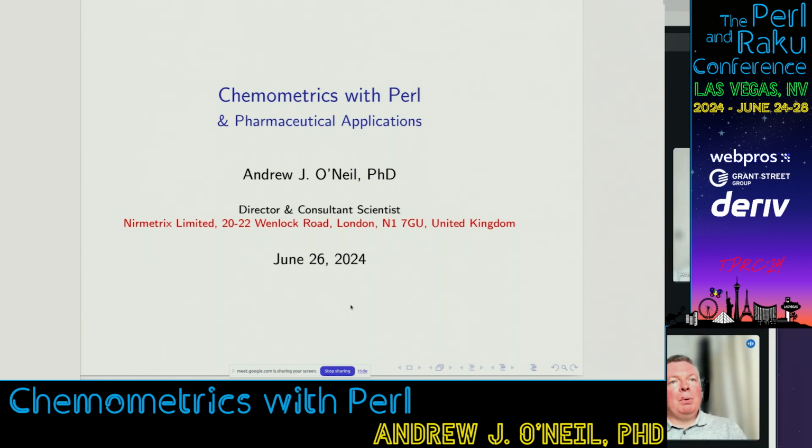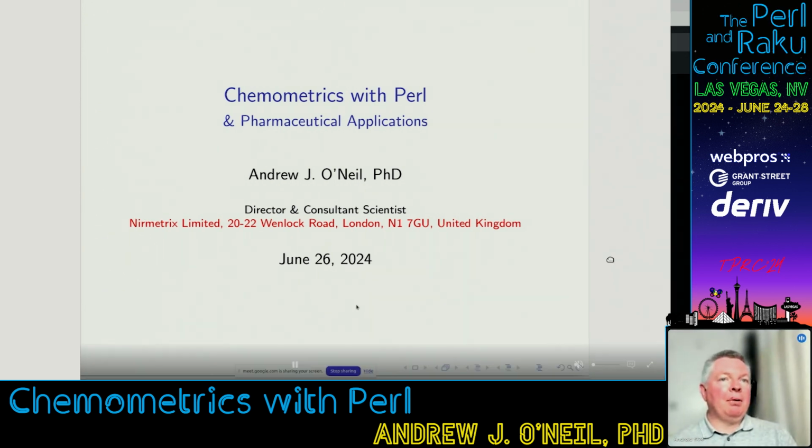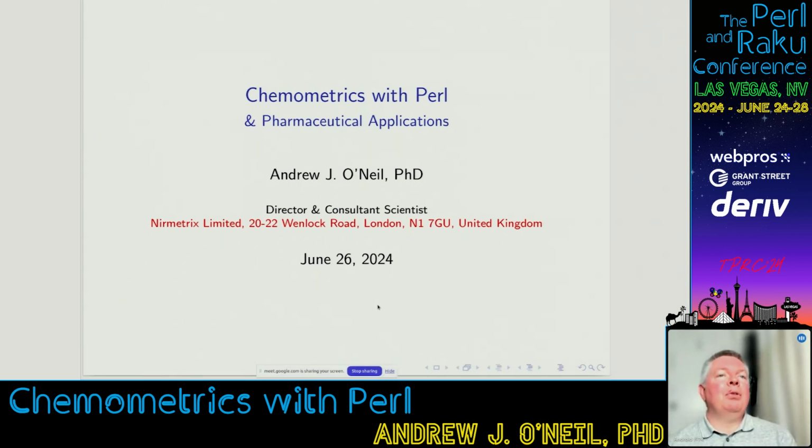My talk today, as Will has said, is about chemometrics with Perl and pharmaceutical applications. My background originally is I trained as a pharmacist in the United Kingdom, so I still do research and development work on pharmaceuticals and spectroscopic analysis, which requires pattern recognition and machine learning algorithms, which we tend to call chemometrics. Chemical data analysis is called chemometrics.